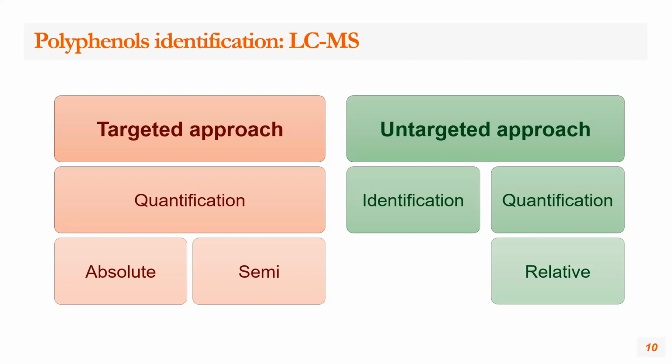So for example, if we have a kaempferol 7-glucoside, the one that I mentioned before, and we want to measure it, and we don't have the kaempferol 7-glucoside, but we have the kaempferol 3-glucoside, for example, we can use that as a standard, and it's called calculating the equivalent. But it's not absolute quantification, it's just giving an idea about the amounts there.